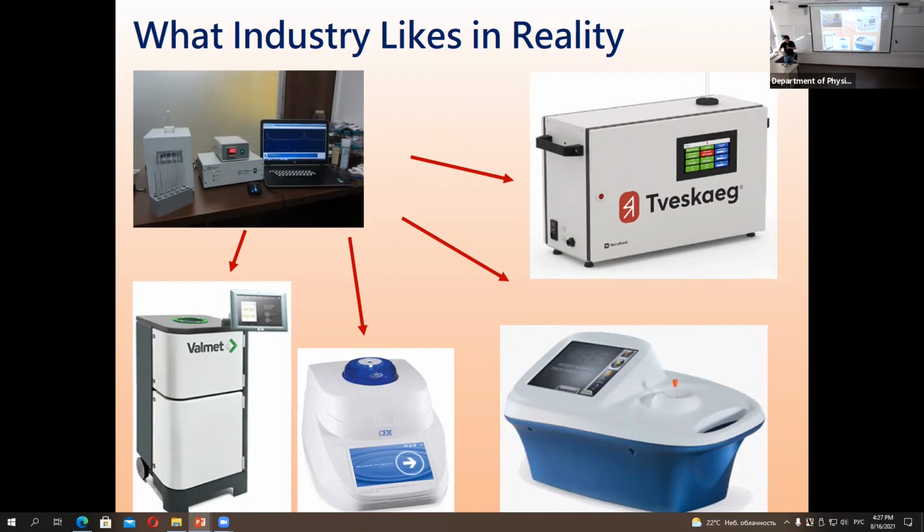The same we have back in MRI. When we are going inside the magnet, we are experiencing strong pulses, but nothing is changing because the energy of these pulses is really low. This is the lowest energy in all spectroscopic methods. Even the sunlight is stronger.